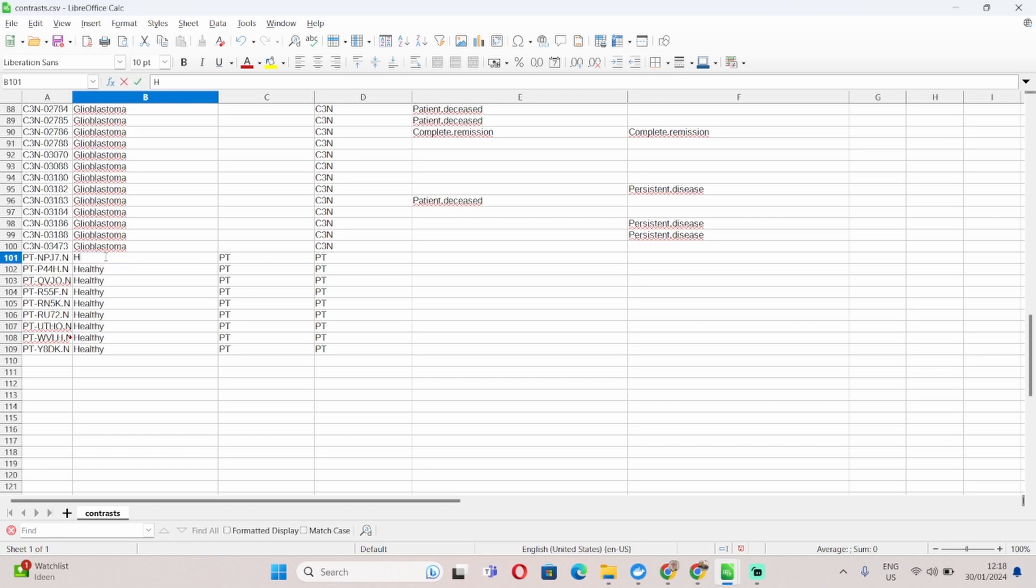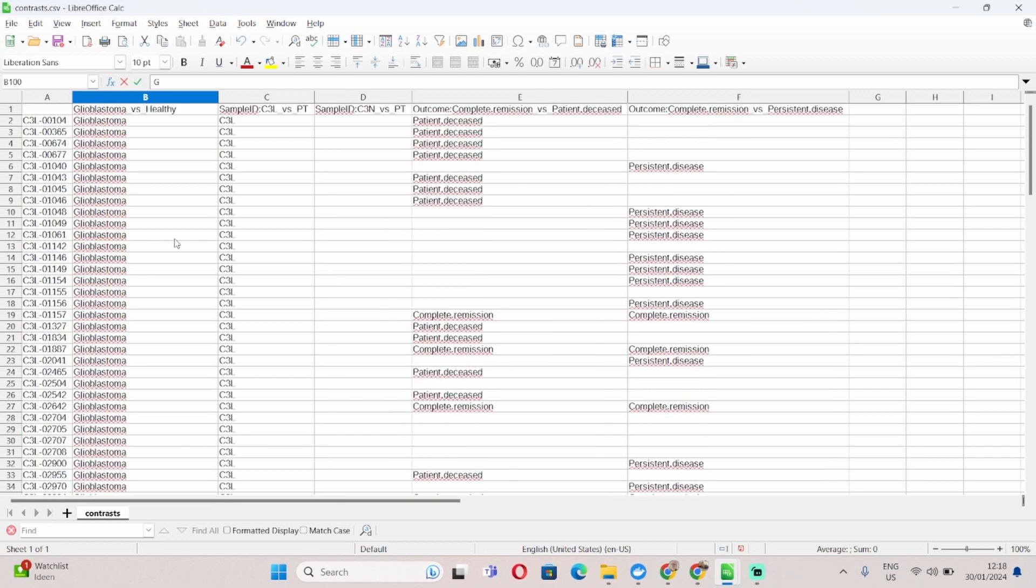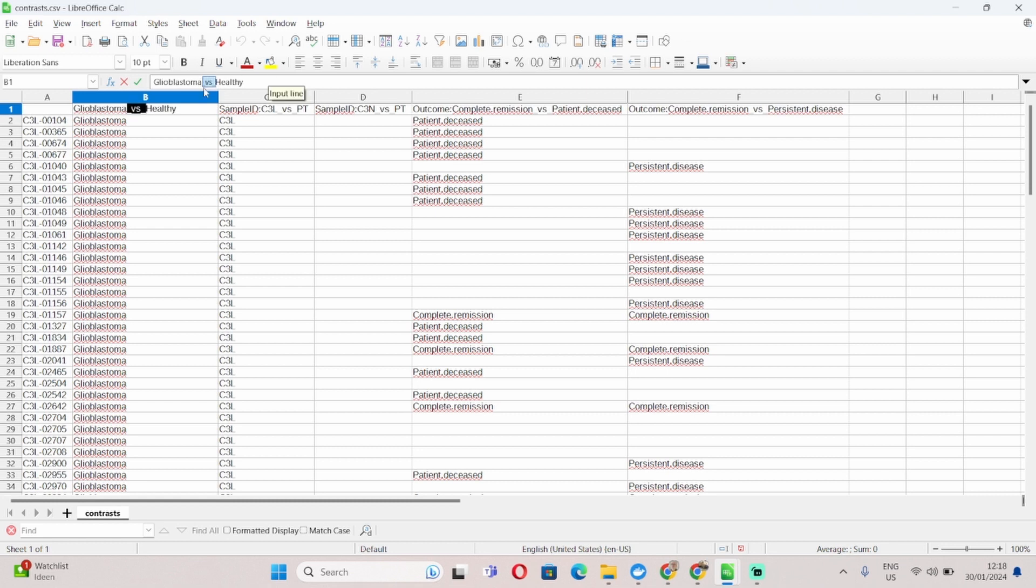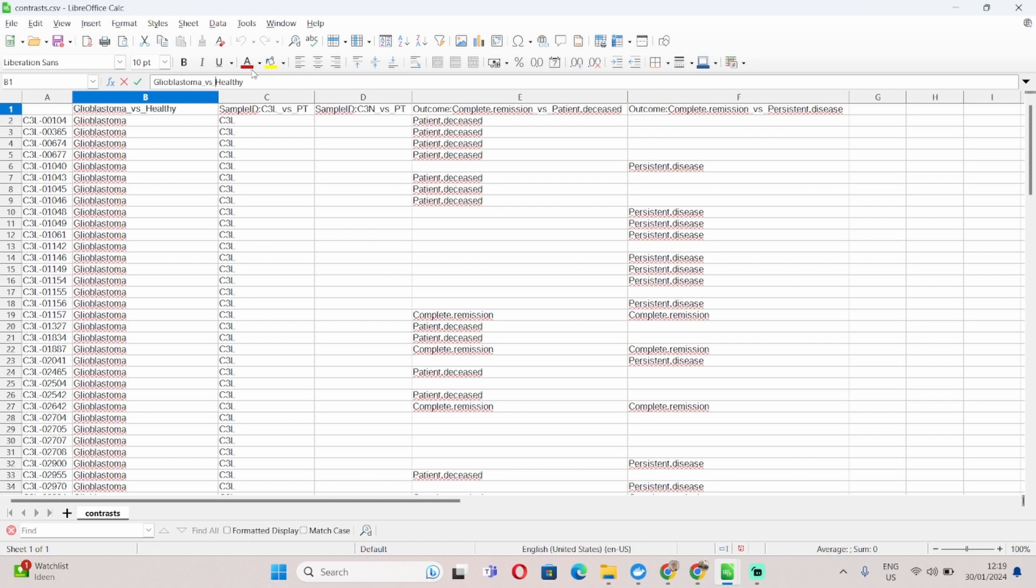But I could have easily used any other naming system. I could have called for example the healthy ones just H, and the glioblastomas just G. That's absolutely fine. However, one important factor in the naming of the pairwise comparisons is that all of them need to contain this element here, underscore versus underscore. You cannot produce any of the pairwise comparisons without that element. So this will not work. It only will work if you include underscore versus underscore.